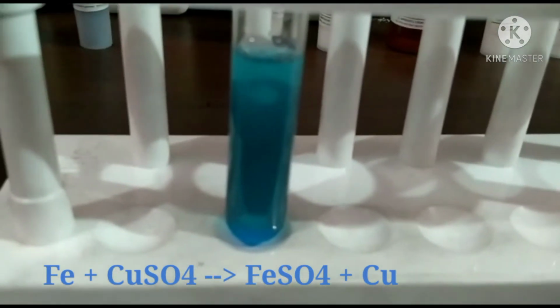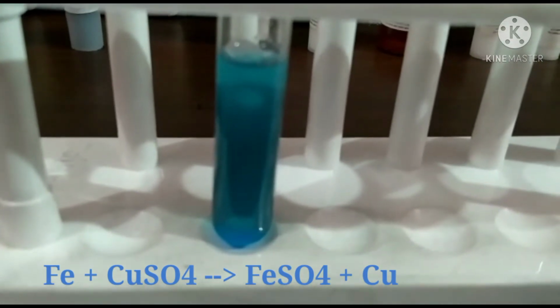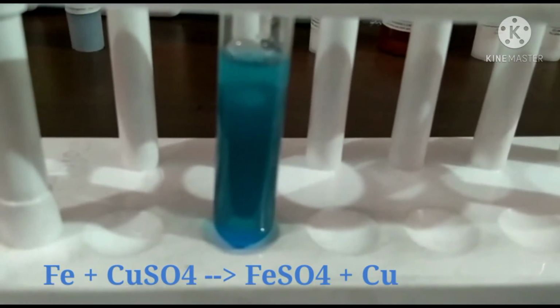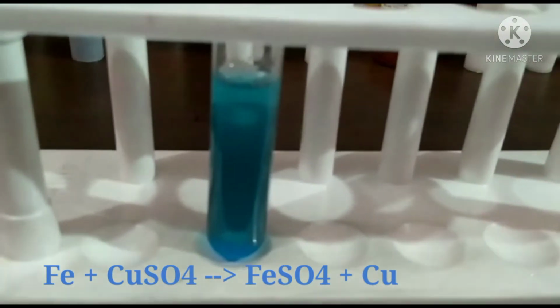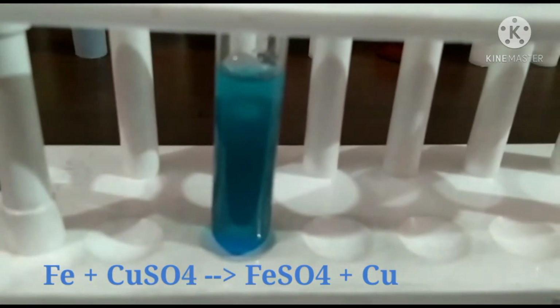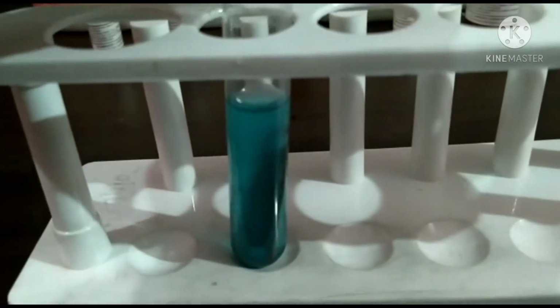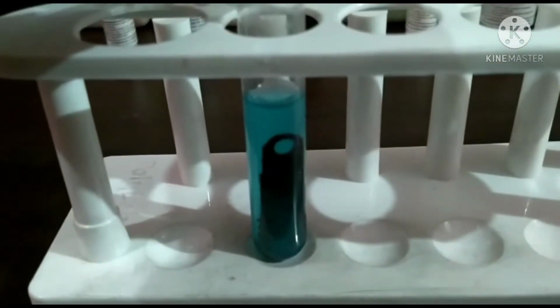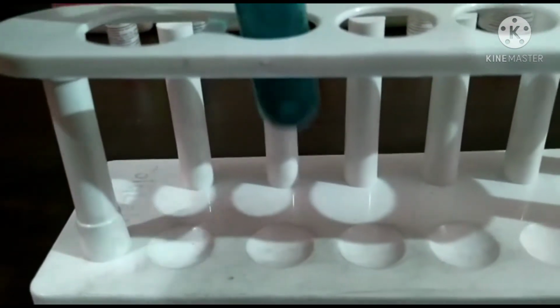This is a displacement reaction. Iron, a more reactive element, displaces less reactive copper from its solution. Hence we observe iron sulfate in the solution and copper deposit on the iron. Observe the solution. The solution is slightly changing its color. Also you will observe that the silver color iron has become brownish in color.